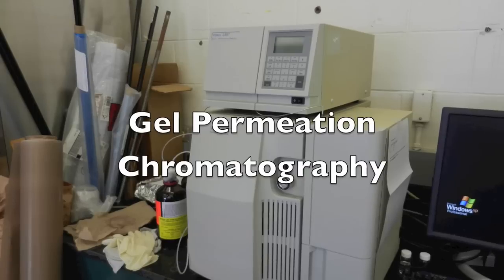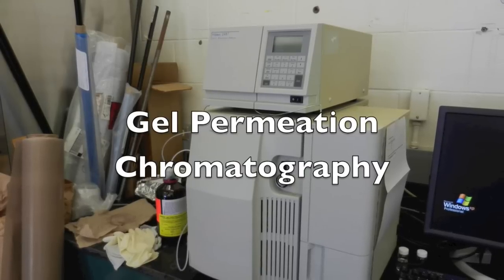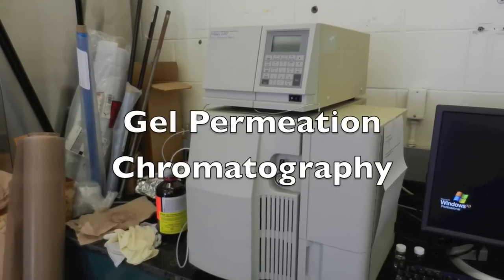Gel permeation chromatography, or GPC, is a separation method used to estimate the molecular weight distribution of polymers.